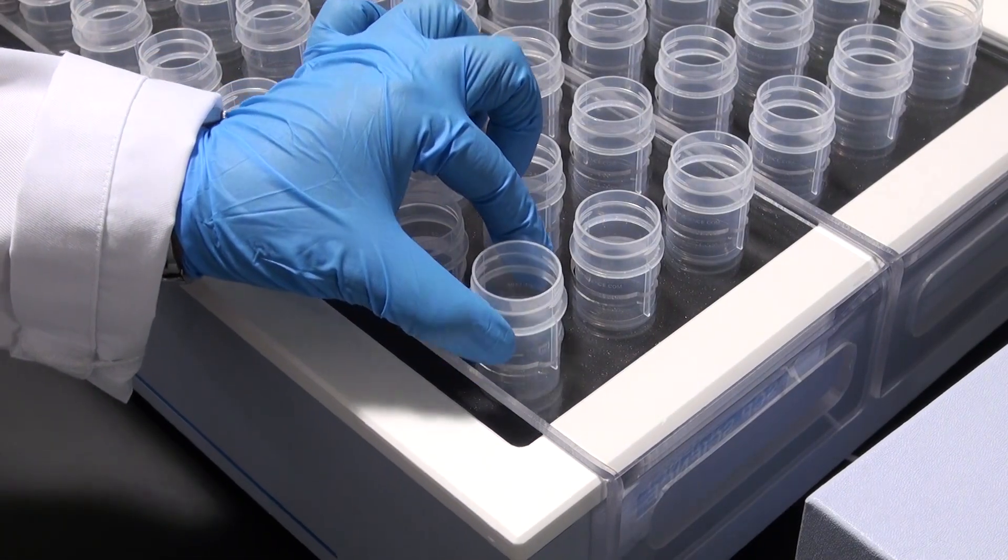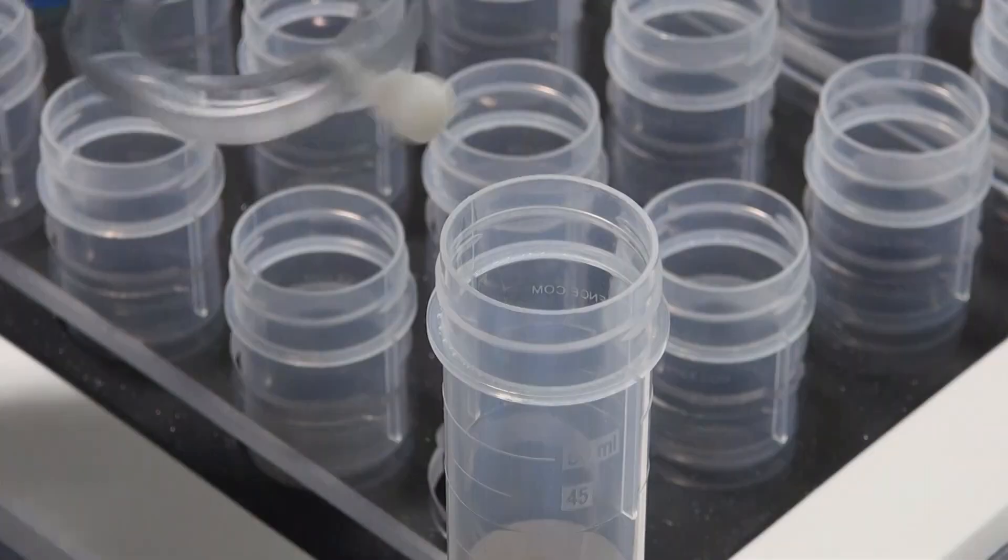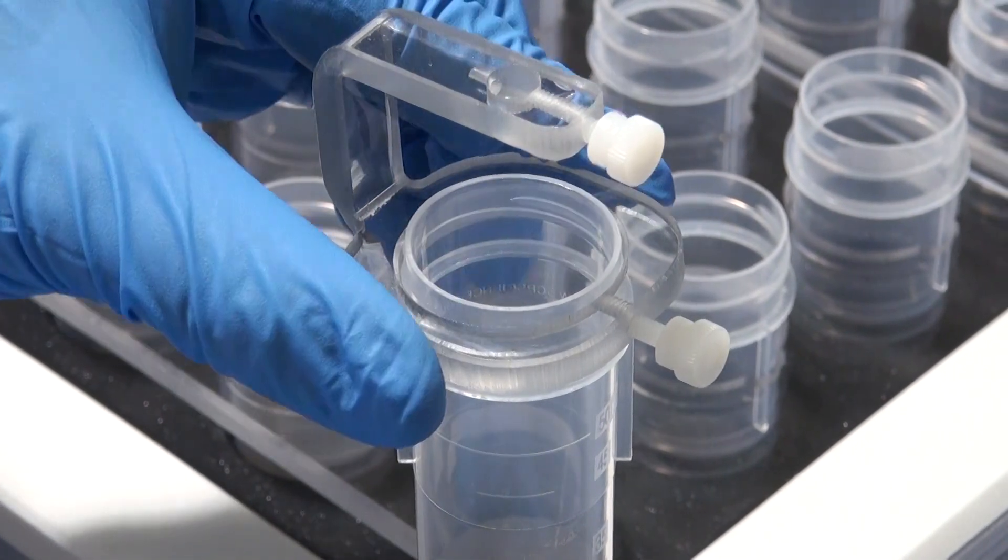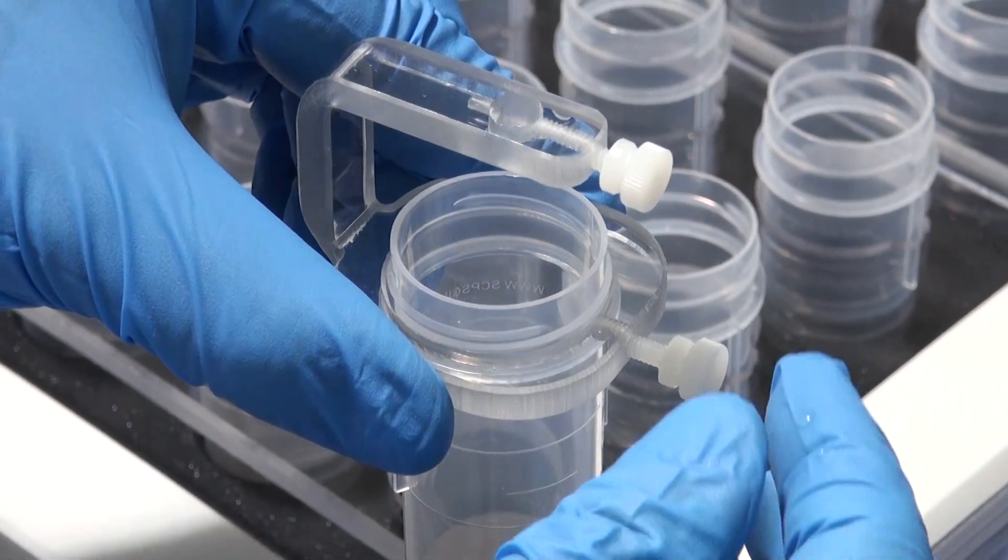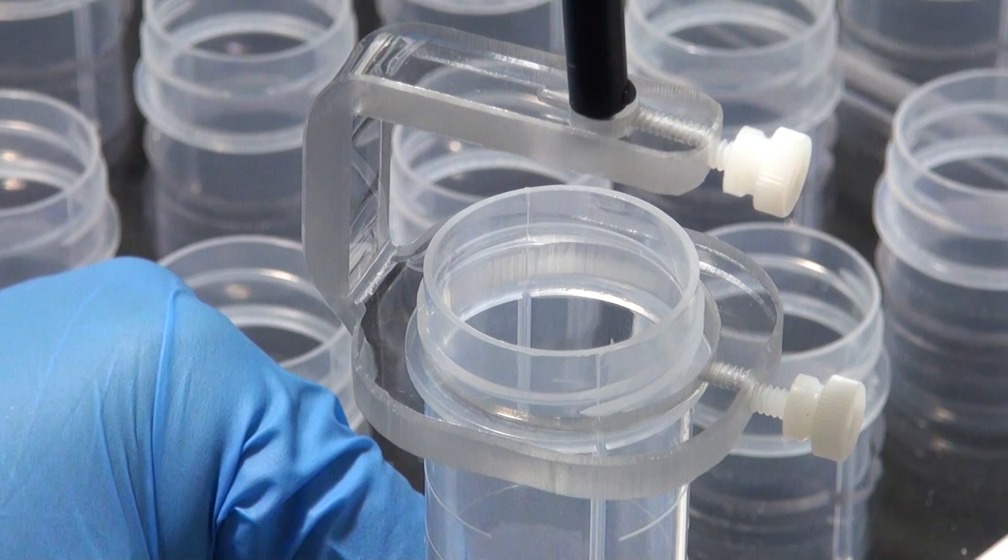Digiset is designed for methods requiring sample reduction and evaporation. Digiset is programmed to shut off the block once a predetermined volume of sample is reached in a Digitube. It is connected to the block and a PFA-coated probe is placed using an adjustable probe mount at a specific volume.